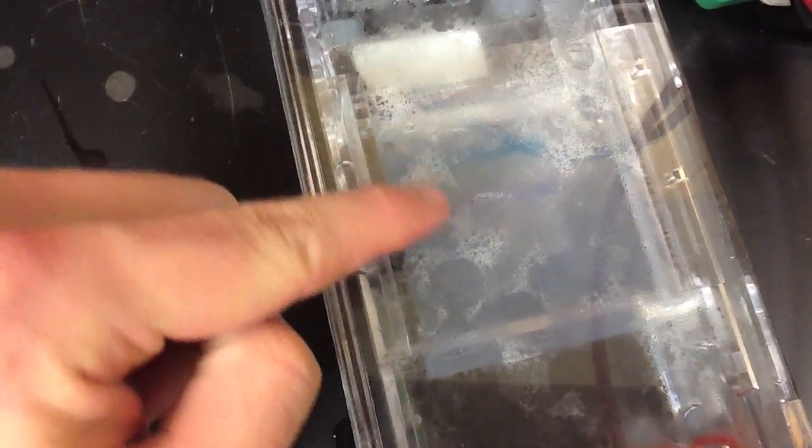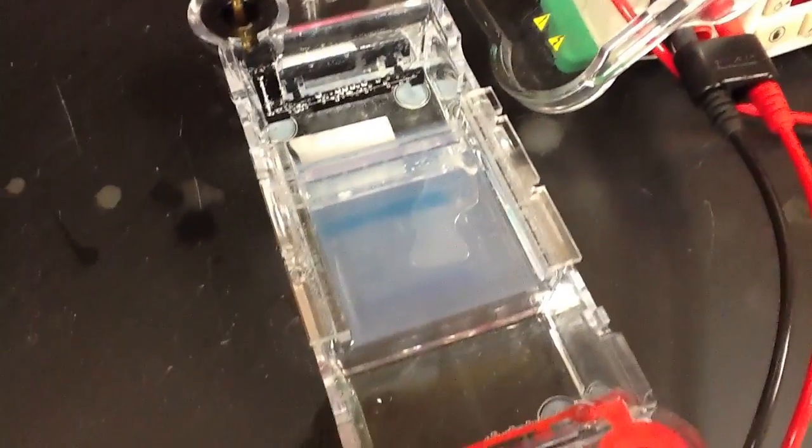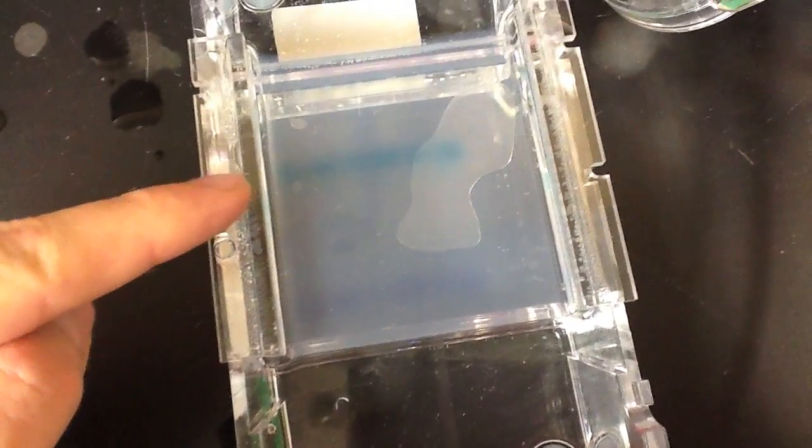As time proceeds, we'll notice that the dye actually moves through the gel, giving us a very distinct front that we can follow. Notice there are two fronts here, an aqua-colored one and a blue one.